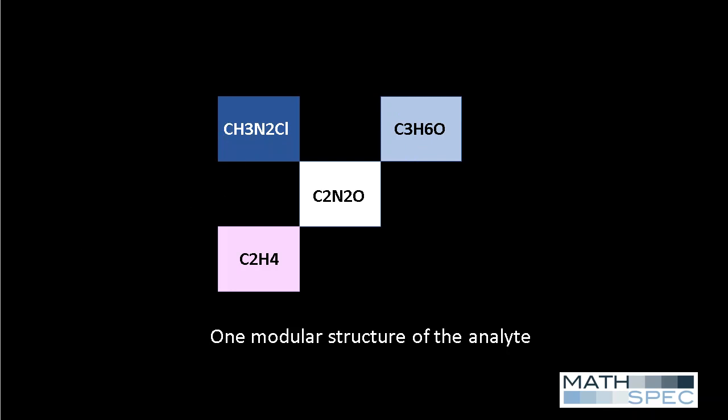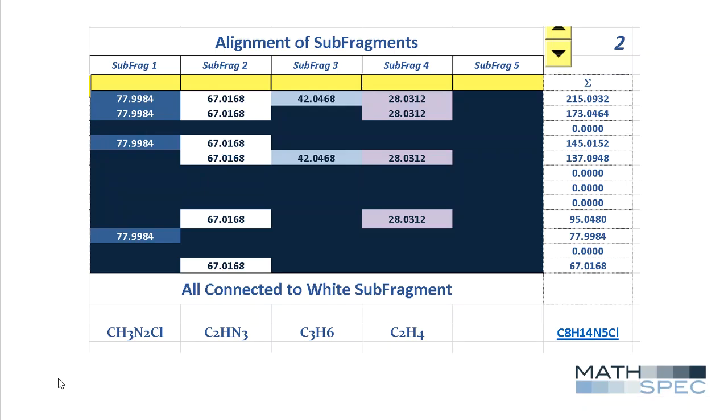Now, the reason I chose that one is I can run the same analysis on MassBank's spectrum LU071803, which is an authentic sample of atrazine, and compare its modular structures to the known structure of atrazine.